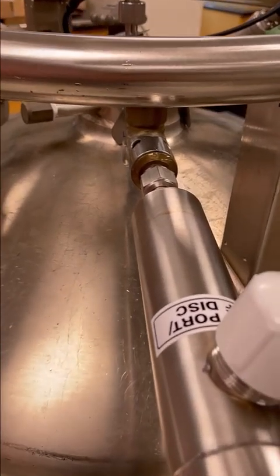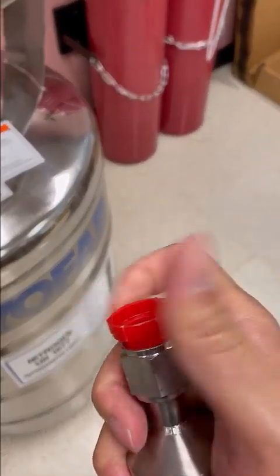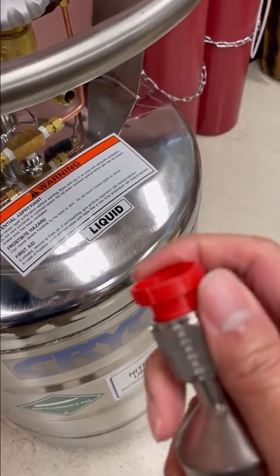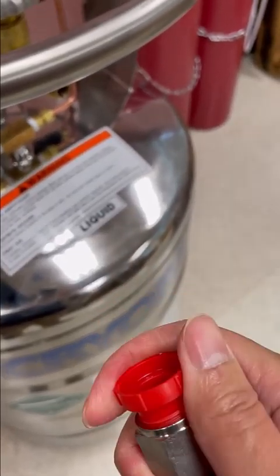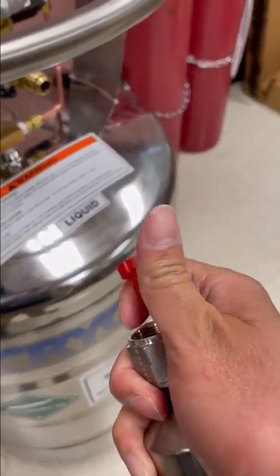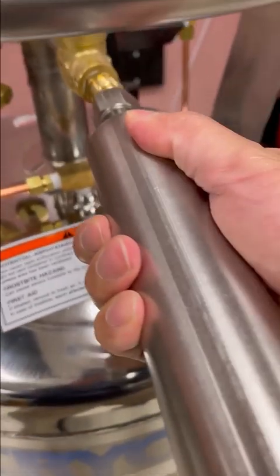After connecting the transfer line to here, I will connect it to our demo unit. The first thing is to take off this cover. Just keep rotating. You might need a wrench if it doesn't work, then I will connect it to the liquid side.